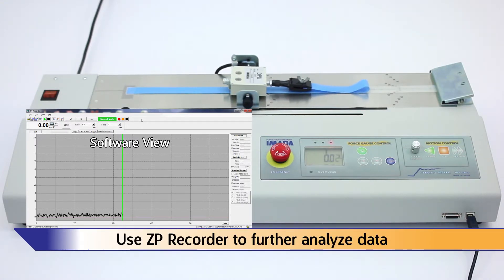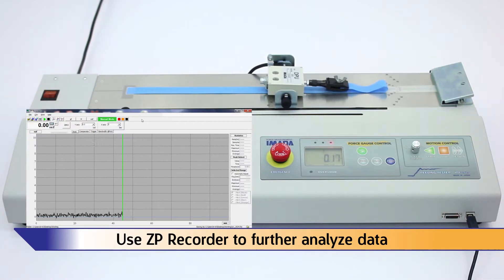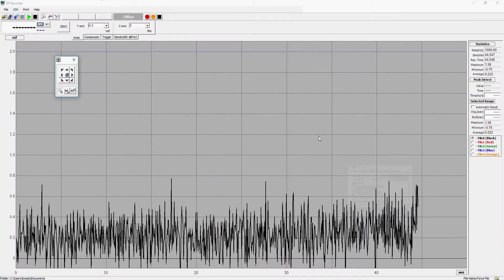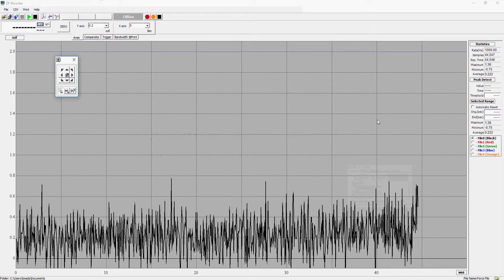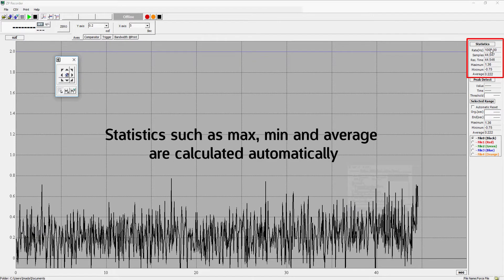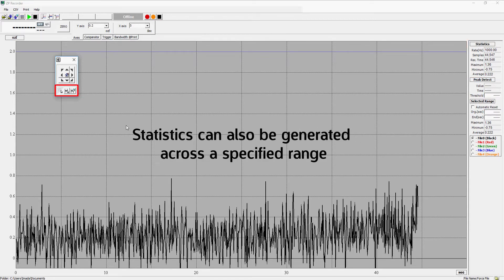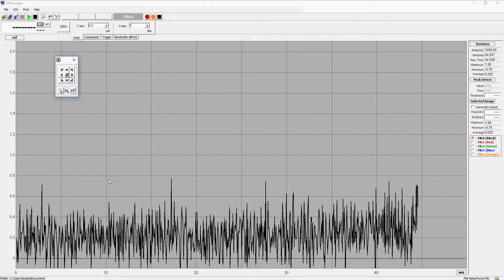Use ZP Recorder to further analyze the data. ZP Recorder features a 1000 data per second sampling rate. Statistics such as max, min, and average are calculated automatically. Statistics can also be generated across a specified range — use the range selection tool and statistics are calculated automatically.